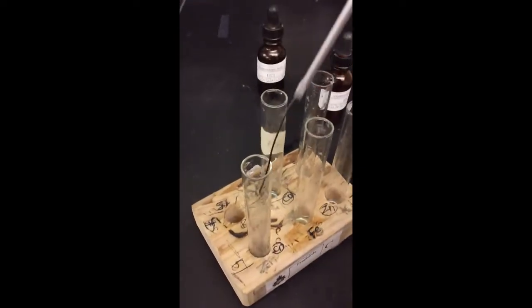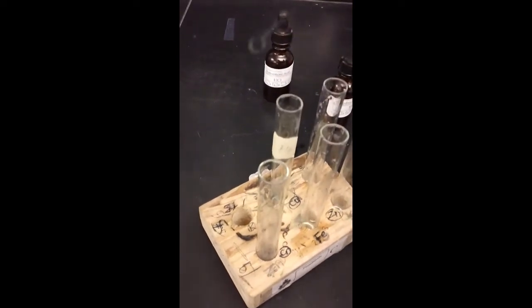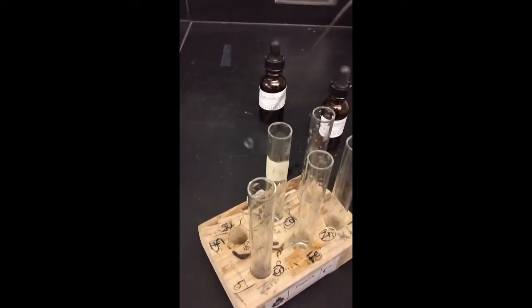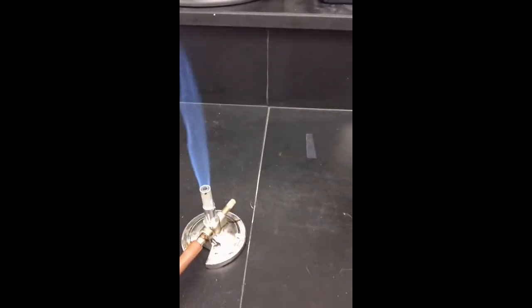Get a good little bubble. Having a hard time getting some on there. Make sure it's down there. There we go. Got a good liquid-filled bubble. Come over here, pay. Oop, lost my bubble. So you got to keep doing it till you have a bubble in that loop.